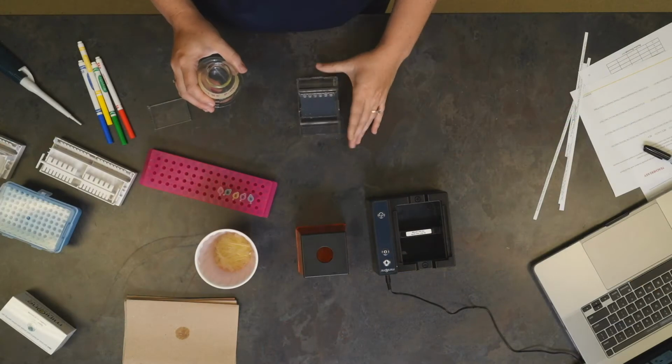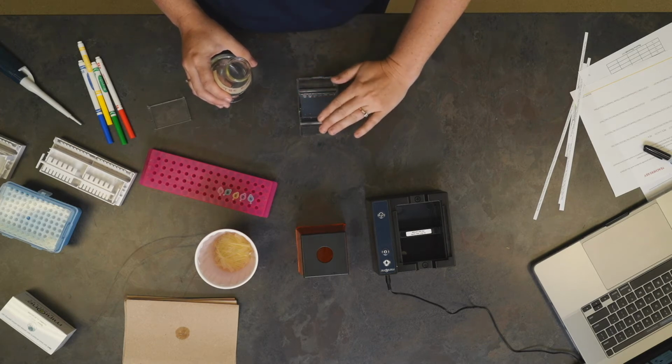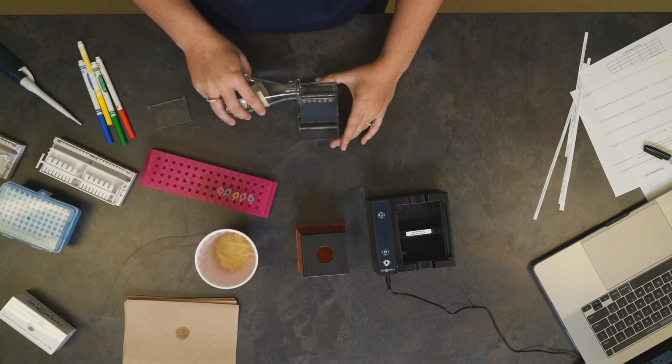I encourage the students to pour the buffer only on one side. That allows the buffer, as it washes over the gel, to force any air bubbles out from underneath the gel and make sure that we have a nice connective surface. This process is all about ease and slow patience.